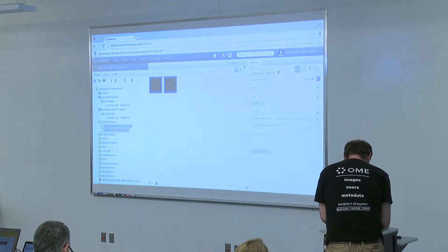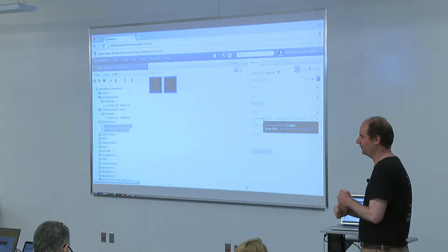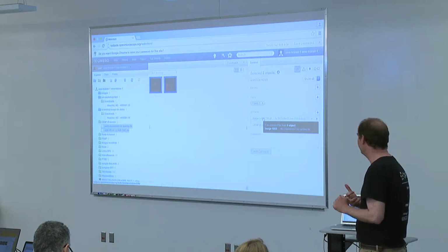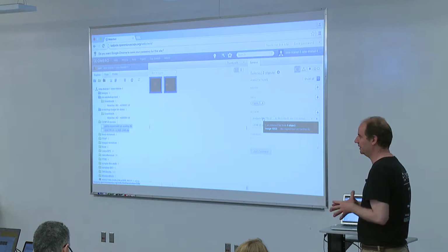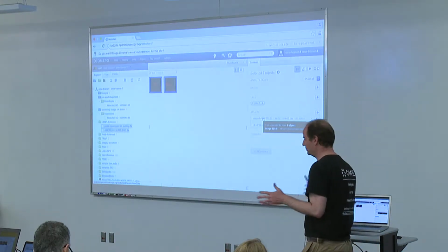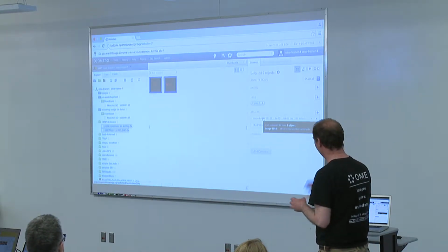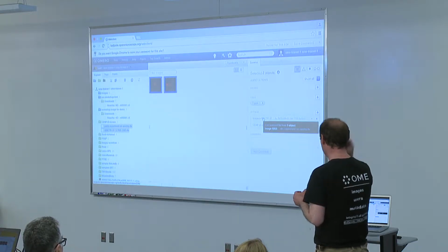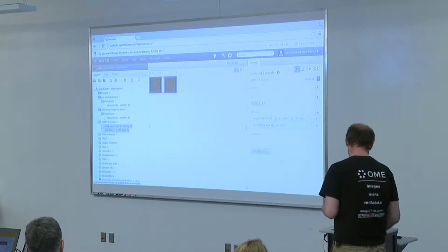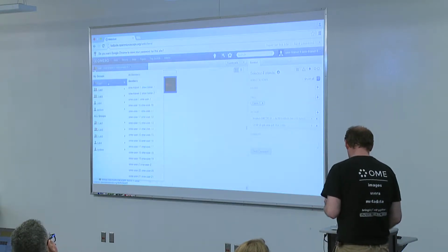As I was mentioning, the advantages of OMERO are that you can cooperate with other people, you can publish things quickly, and you have the metadata and the extensions using the API. So I talked about the extensions already a lot. You actually saw the example of ImageJ. You saw the batch actions on the server. You didn't see much of the cooperation. Well, the cooperation is most easily demonstrated by this.